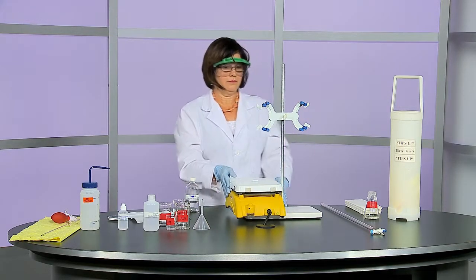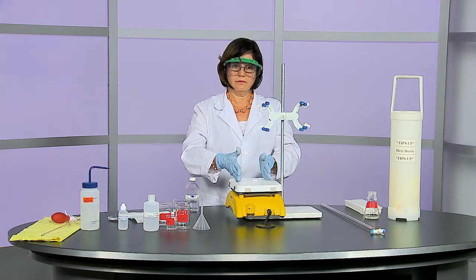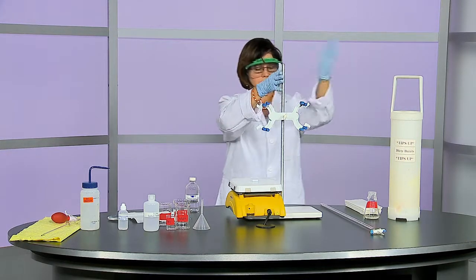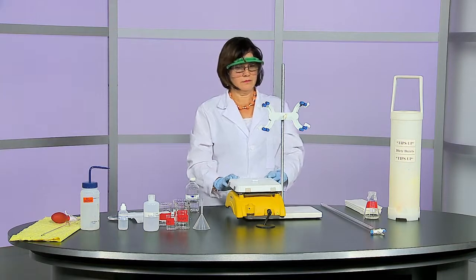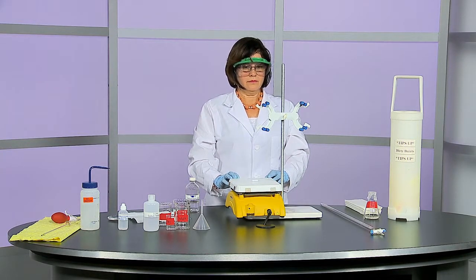If you are right-handed, place the electric stirrer to the right side of the stand. If left-handed, place it on the left hand of the stand. This will ensure that you can reach the stopcock on the burette.